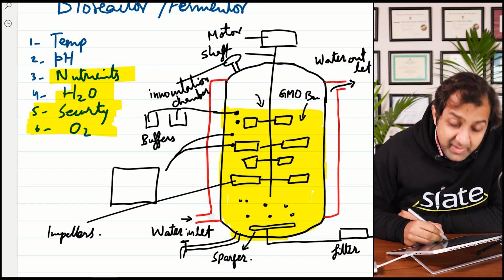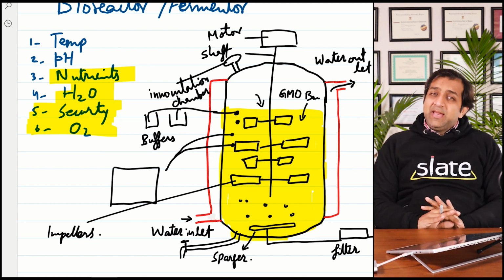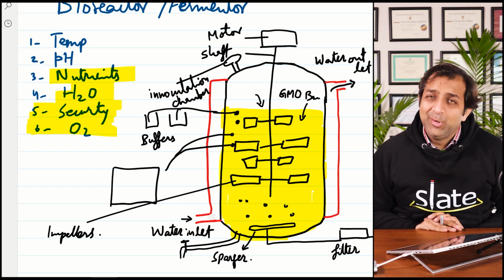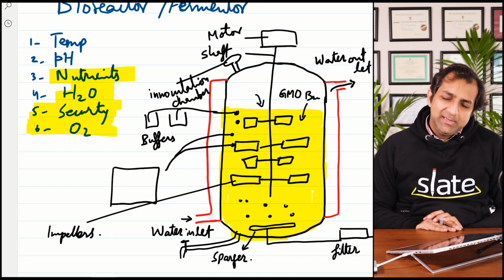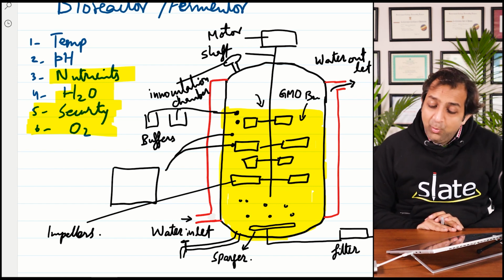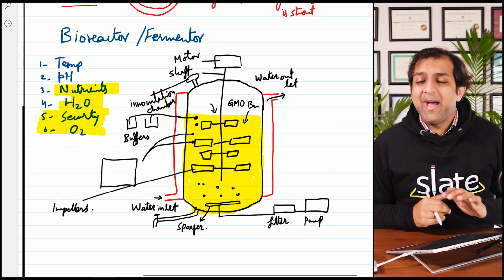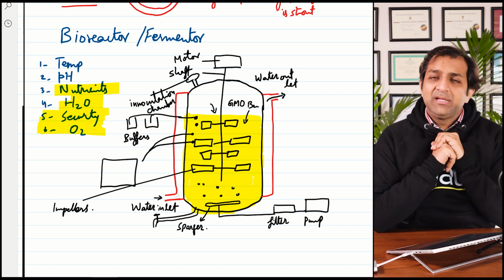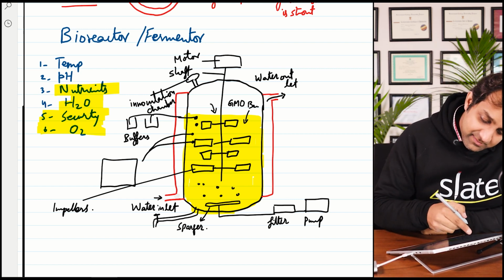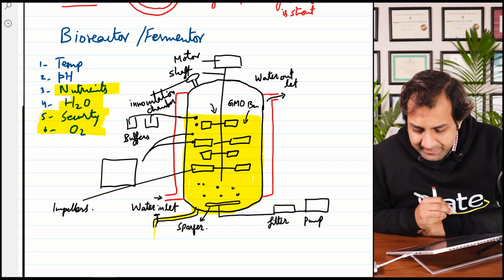We wait for a good period of time, providing all the good conditions to the bacteria. Now we are expecting that this transformed bacteria that was carrying an insulin gene will start producing insulin. And once this batch is complete, we can extract all the contents which were here and then we can extract insulin from that material.